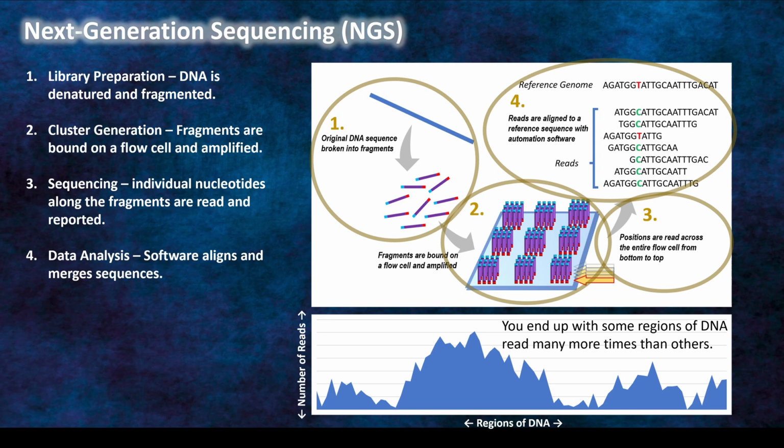This is one reason why, after your test is run, it can take a while for next generation sequencing to produce the results, and they may have to be double checked because there's a lot of software that goes behind this in order to put it all back together. Often a human has to look that over and decide whether or not it called all of these pieces correctly or not, and maybe adjust a few things here and there.